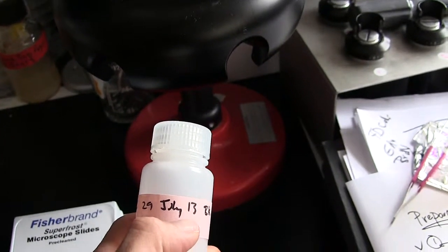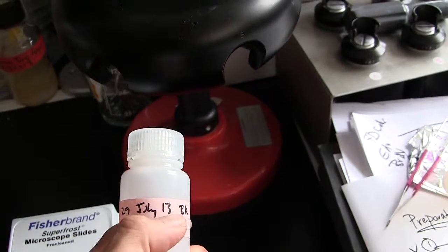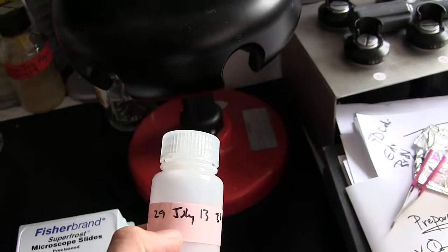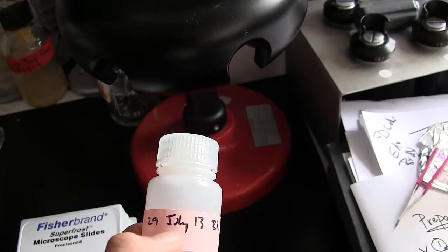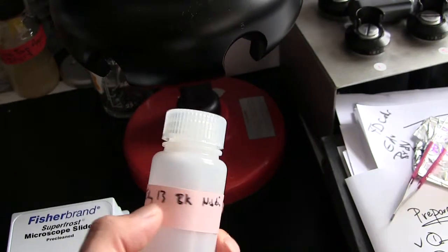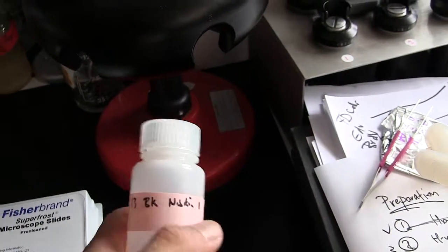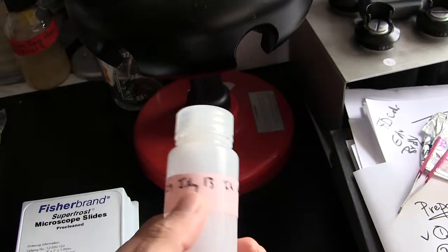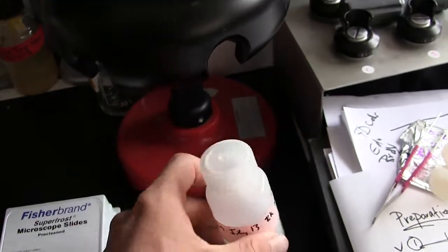Because we have people from different national origins in the lab, we should write out the full date, because 7/3/13 means very different things to people from the United States than it does to people from other areas of the world, even from Canada. So please write out the full date so there's no confusion there at all, no ambiguity. Then my initials, in my case BK, and then Niskin 1. So site, nature of the sample, date, initials of the person who took the sample, and then the Niskin number.